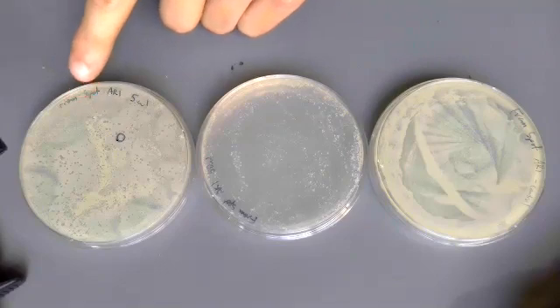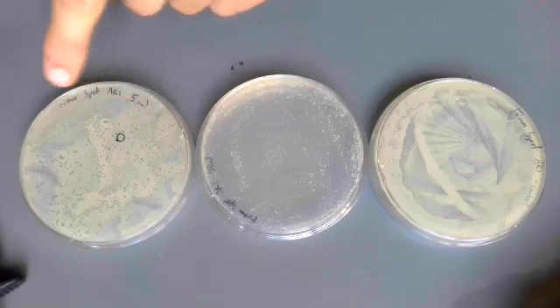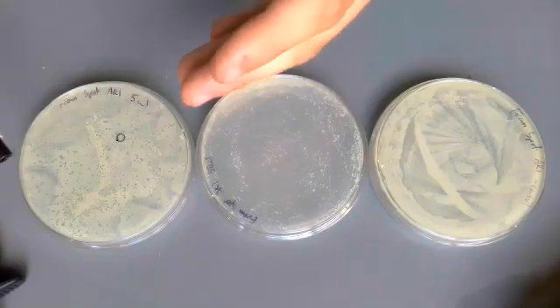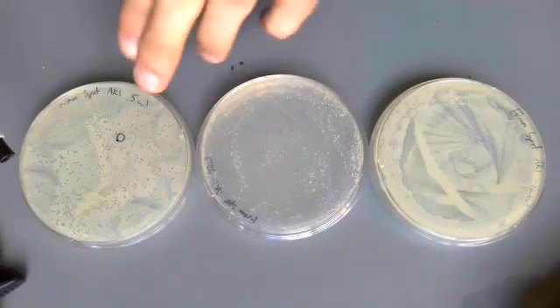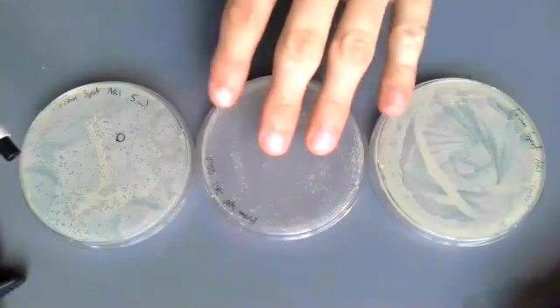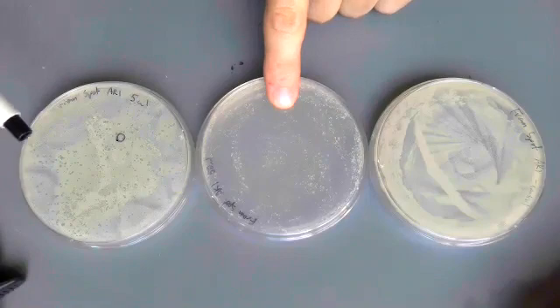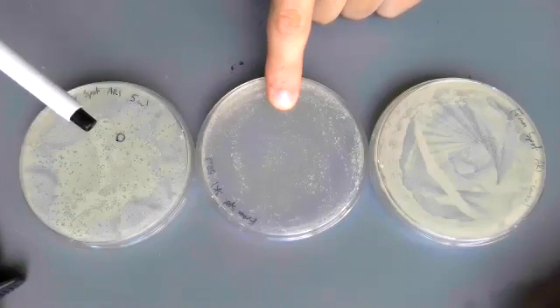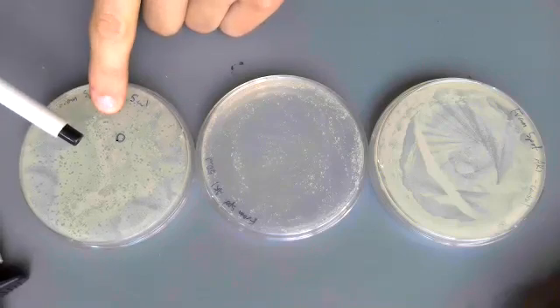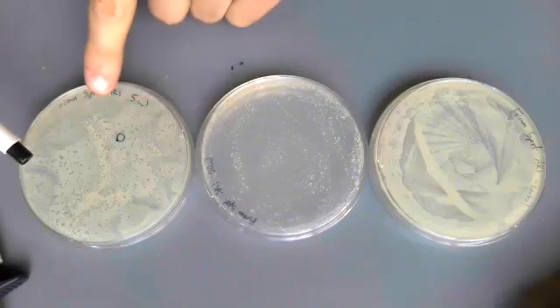Here on this five microliter phage sample, we see well-isolated plaques in the bacteria lawn where phage colonized in the host bacteria and then started to spread. We can't really work with non-isolated plaques, so this plate in the middle is a little too overrun with phage, whereas here we can make sure that we have a pure sample of phage because we have plaques that are separated from each other.